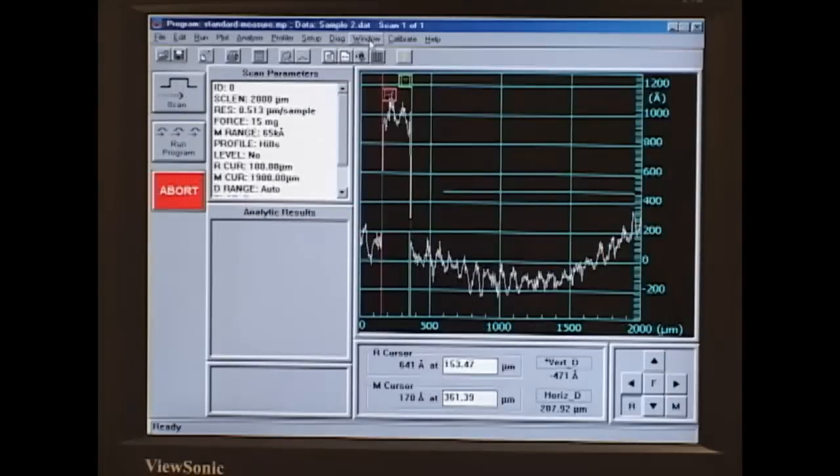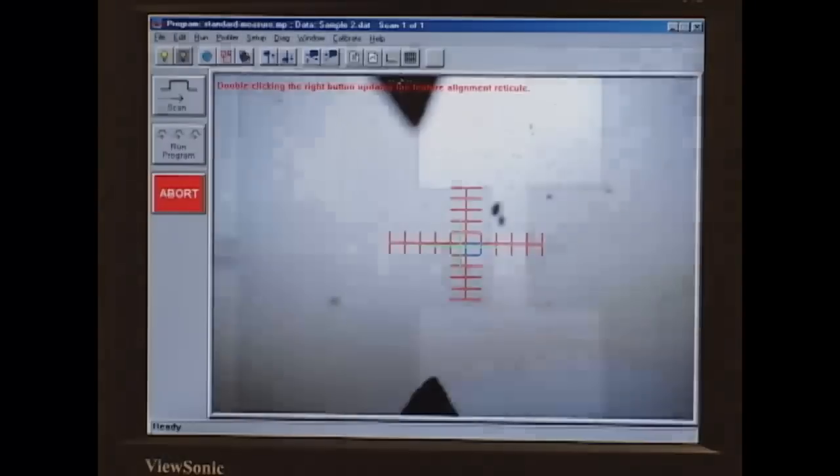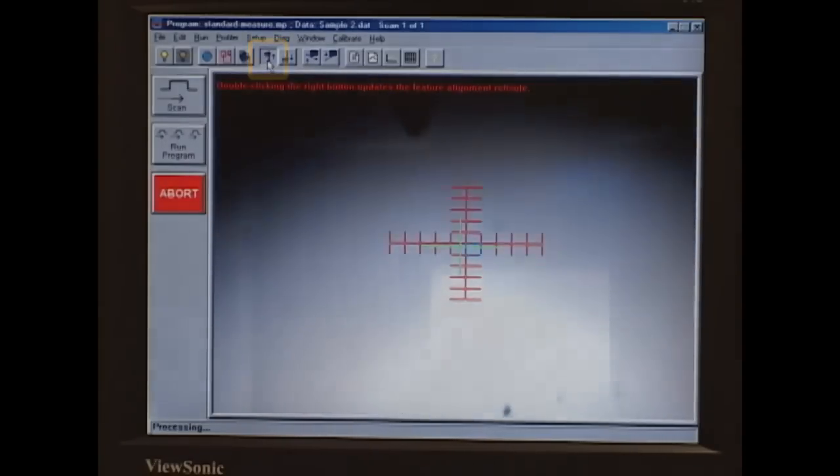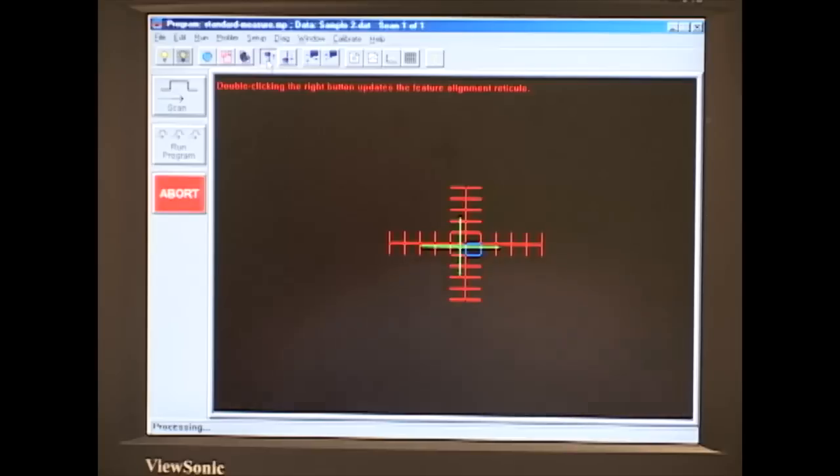So when we're finished, we'll go to the Window tab and the Sample Positioning button. And we'll go over here to the Tower Up to Load Position button. Click that. And that will bring the stylus out of the way so that you can remove your sample.